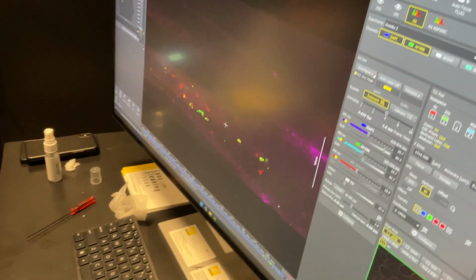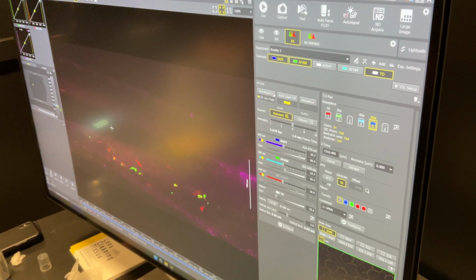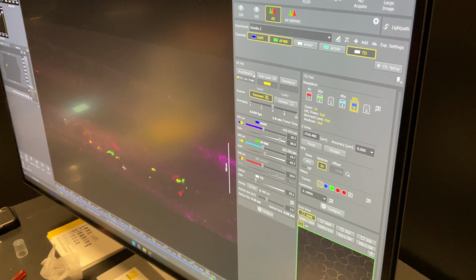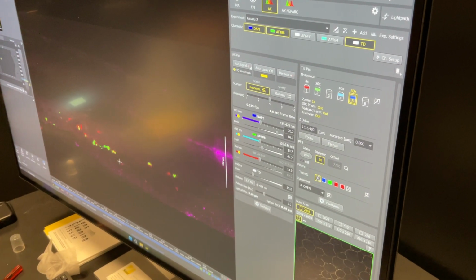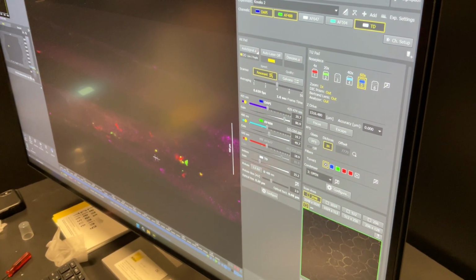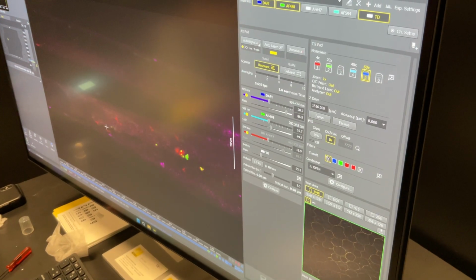What this is, it's a zebrafish tail. It's a Z-stack in tissue, and Josh and I are both different samples. Obviously, I'm doing zebrafish, he isn't, and this is just the original file. I'm trying to see the intensity of the third far red channel in the macrophages, which are these little red cells, and also distinguish between the infected and uninfected cells.